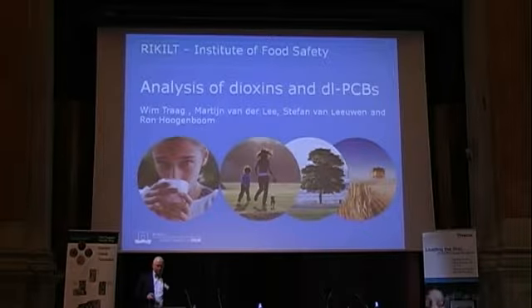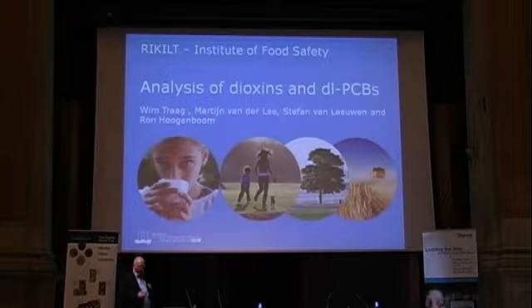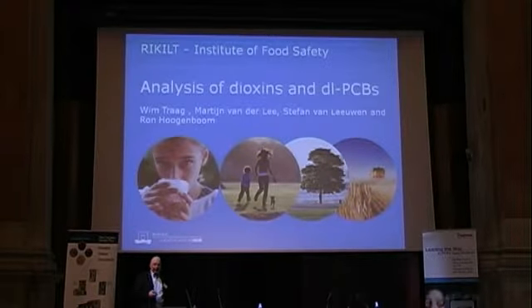The latest result I have seen, I did together with Rainer Malisch from the EURL as well as with Alexander Kotz from Freiburg. We worked on the MSMS technology using not electron impact ionization, but atmospheric pressure ionization. By doing that, you gain a lot of sensitivity. With this technology, we achieve more or less the same sensitivity as with the high-resolution MS. And we will continue to work on that technology together with the colleagues in Freiburg.